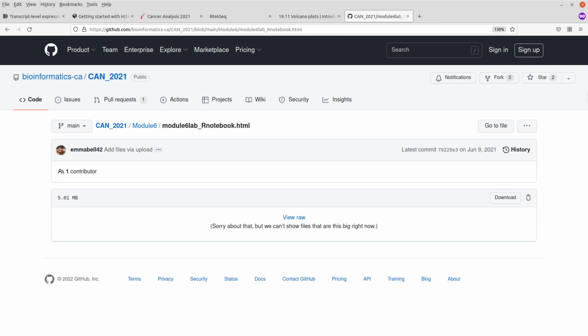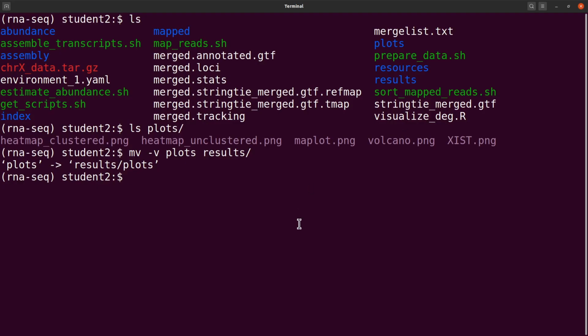Once you are done with the analysis, what you need to do is to deactivate your environment so that you can just close it. So I'll just say conda deactivate. Perfect. Now I have deactivated the environment, so everything is now clear.